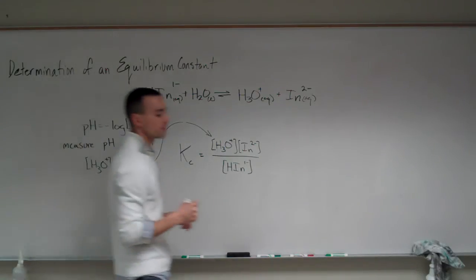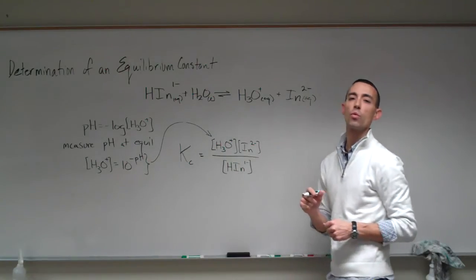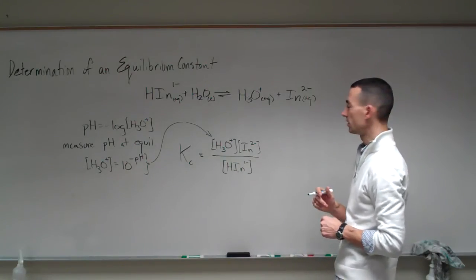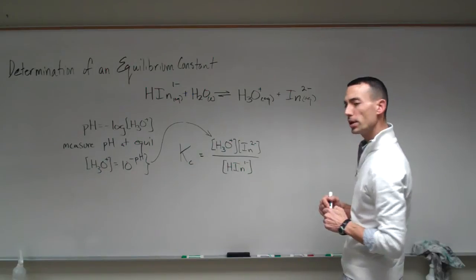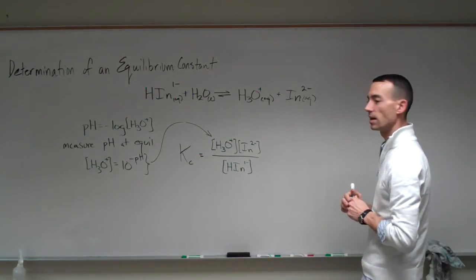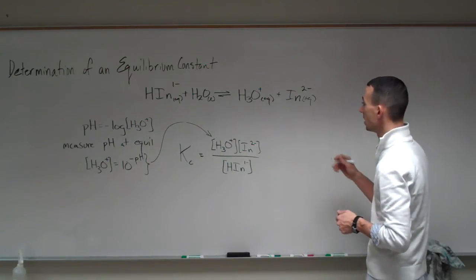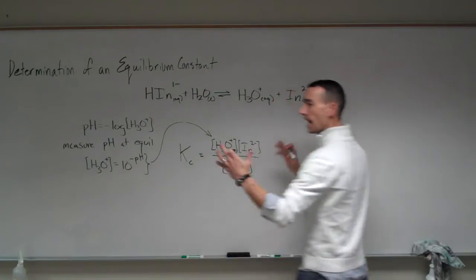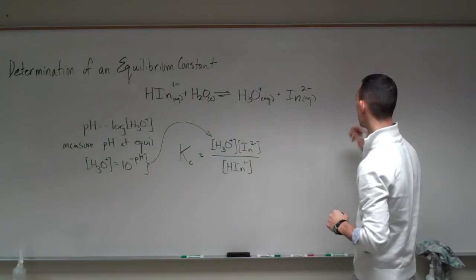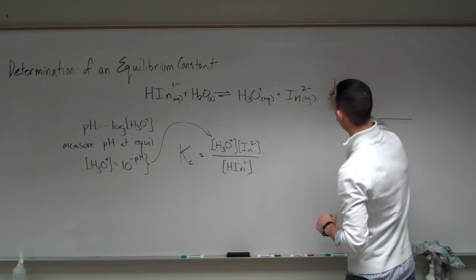So that's pretty easy and pretty direct. It's the other two that we have to do a little bit more work to come up with their concentrations. We're going to use UV-Vis spectroscopy, like we have in a couple of other cases this semester, to measure one of these two. Both of these are active in the ultraviolet and visible region, and they have different absorbance spectrums.